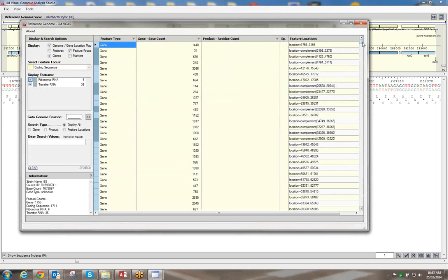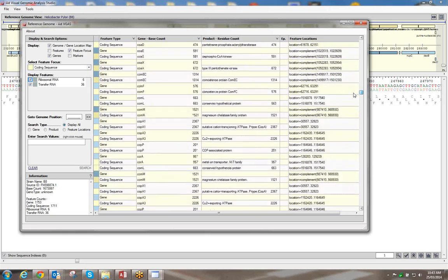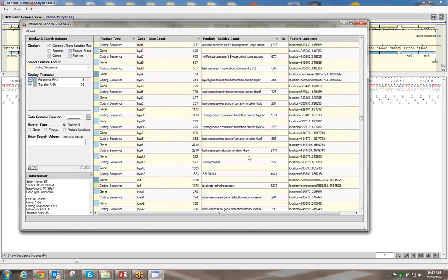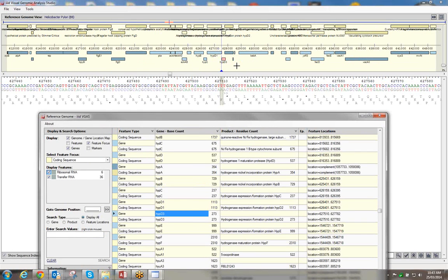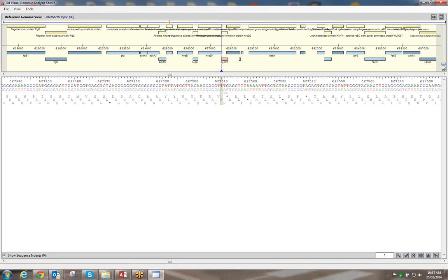The H. pylori genome has around 1,700 coding sequences, all annotated within the GenBank file. You can use the feature list to go to a particular gene position directly. You also notice there's a light blue and a dark blue on the genes — the darker blue is on the complement strand.